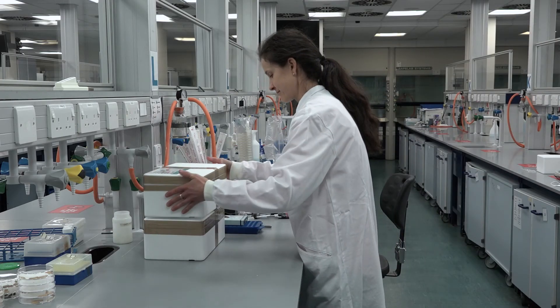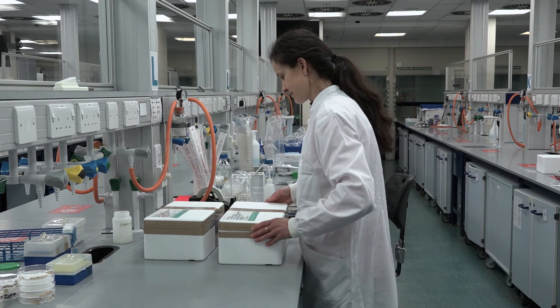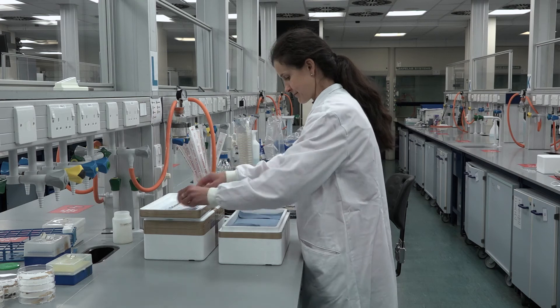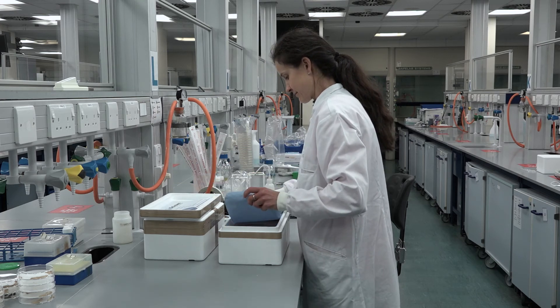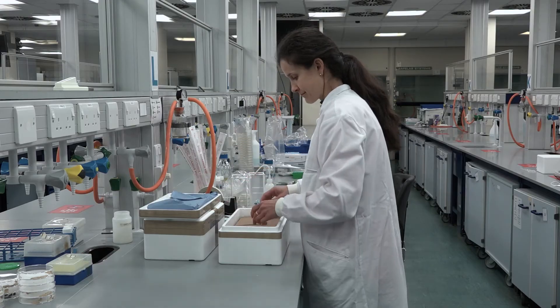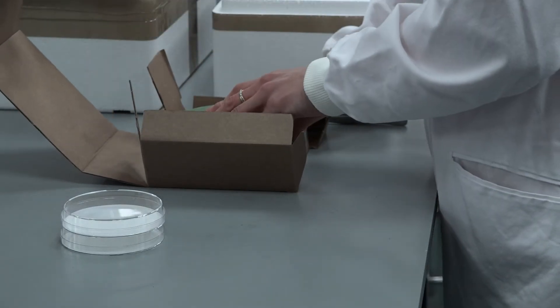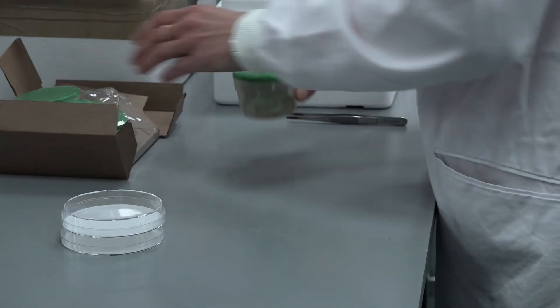Larvae will arrive through the postal system in containers that are ventilated. Remove the outer packaging and place the larvae in their ventilated containers in a 15 degree incubator until you are ready to use them. If you store larvae above 15 degrees, they will develop more quickly and may pupate sooner.